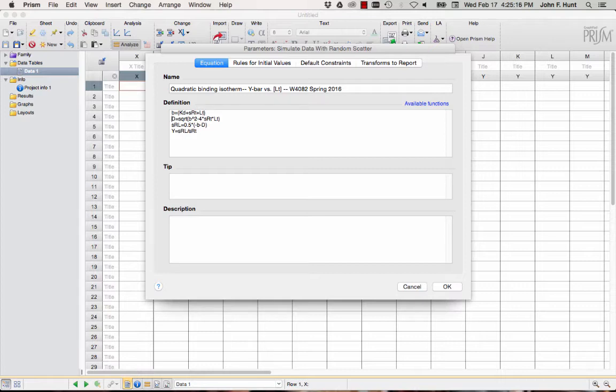Now I can say that d, the discriminant, is the square root of that variable b squared, so it will use this equation as long as it occurs before it as you go down the entry box. B squared minus 4 times SRT times LT, and so now I will write an equation, the solution to the quadratic equation. SRL, I have defined a new variable. That variable is supposed to represent the concentration of the binary complex. So SRL equals 0.5 times negative B minus D.